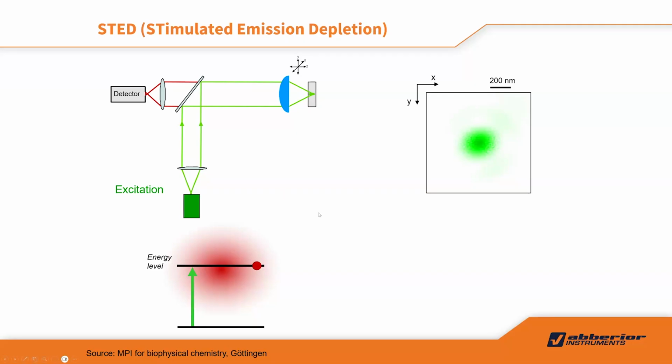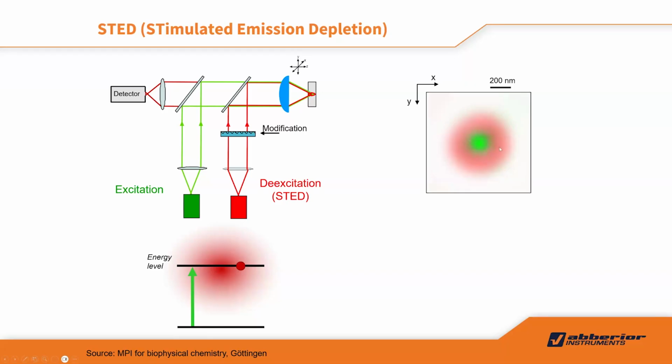So in STED, when the electron is excited to the high energy level and stays there, there's a special term called FLIM, fluorescence lifetime, right? Exactly, it's that time. In the fluorescence lifetime, if you introduce the STED beam in a donut shape overlapping the confocal excitation beam, what would happen? In the overlapped area, there's the STED effect. The STED beam will quench the excited electron, and then it will be de-excited.